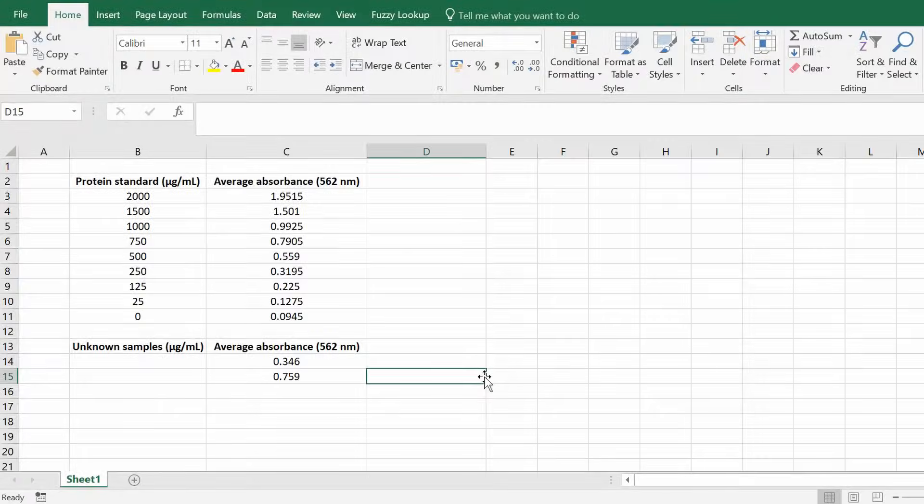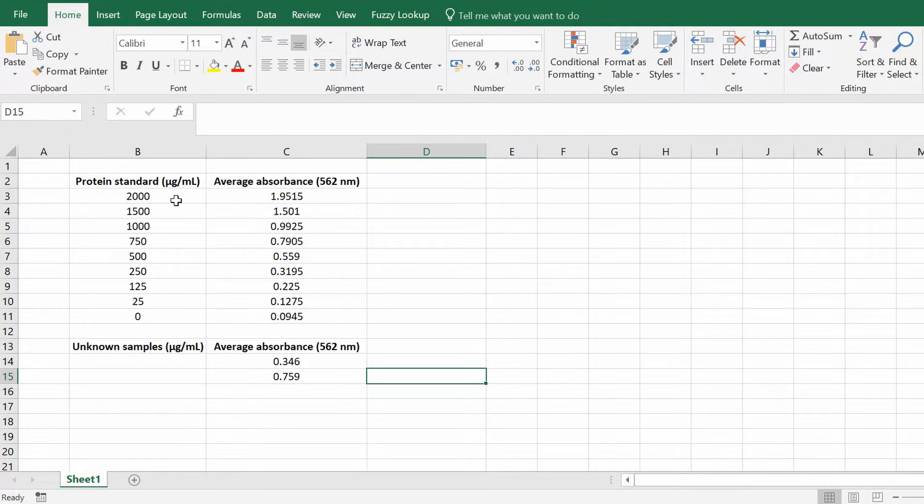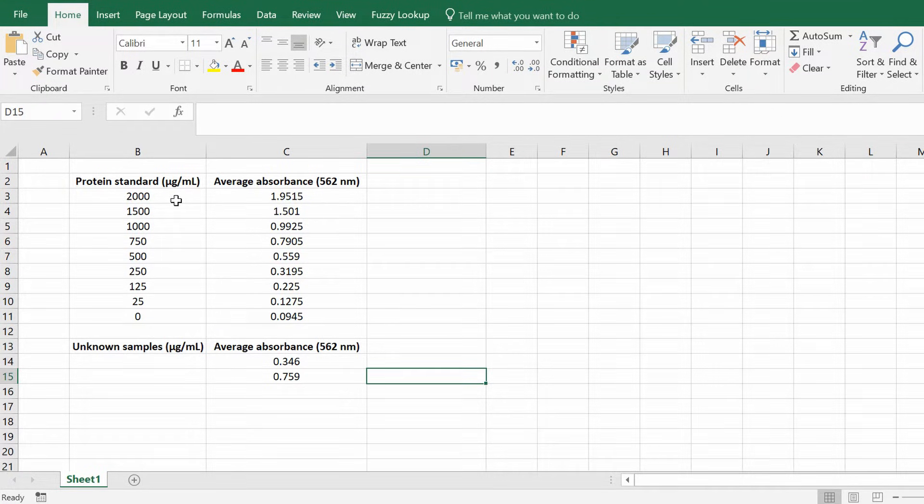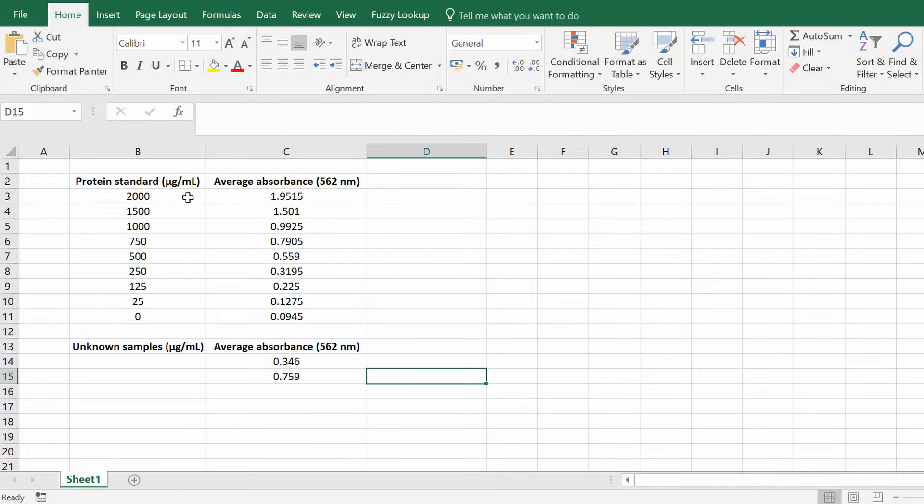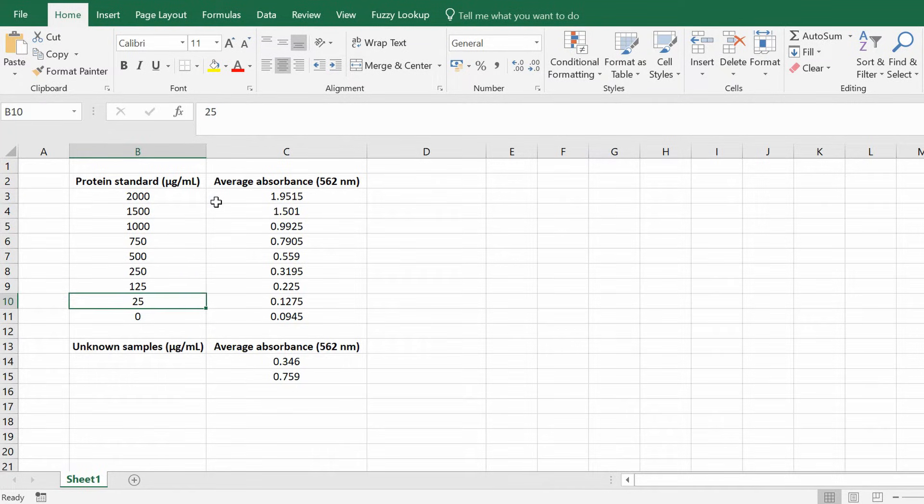So I've got Excel open and I've already got some data inside Excel. I've performed a BCA experiment. This is measuring total protein levels in samples and to do that you create a standard curve, and the standard curve has known values.